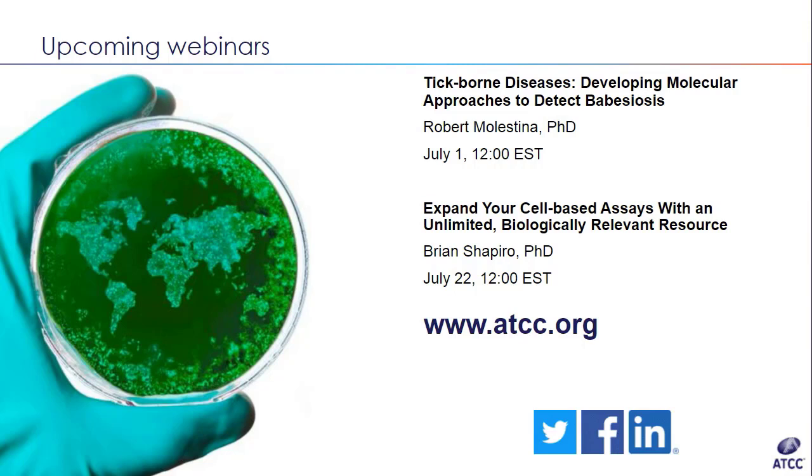The synthetics was based on our experience with that first round of synthetics that we made, because there were some stability issues with those since they were in a dried format. So we added a biostabilizer that was recently pulled off the market.